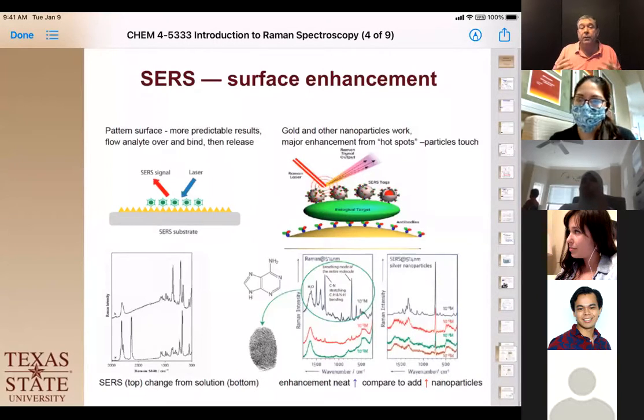They show up really well because, again, the intensity is all about that absorption, and the surface plasmon gave additional energy. Instead of being 0.001% of the signal, it boosted it up to about 0.01%. So it's a 10 to 100 times boost in signal output from surface enhanced Raman spectroscopy. That was a really cool project.